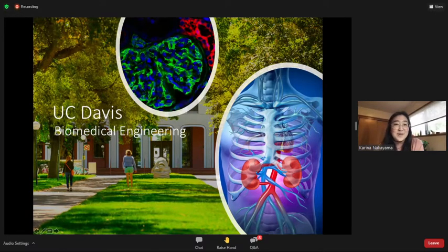And so this is one of my images that I have up here. So this is what your kidney looks like when it's at a very high magnification. So this is called a glomerulus. That's the main filtration unit that all of your blood will filter through, cleans it out, removes toxins, all that great stuff. And so these were some of the structures on that microscopic scale that we try to make, but in a Petri dish in lab.